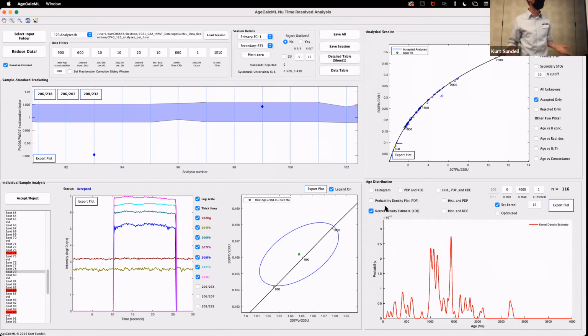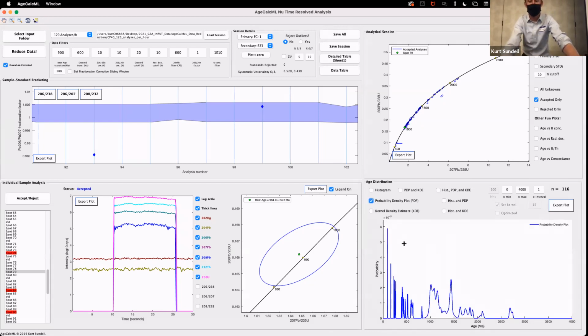But they are a very effective tool to look at your data, in my opinion. I personally use kernel density estimates nowadays for reasons that we'll talk about later, because when you start using quantitative analysis and doing quantitative comparisons, there are some serious issues with PDPs, which you can see very clearly here. And this is a big point that Peter makes in his 2012 papers, says this can lead to misleading results. Look at this highest peak here, it is only high because that Gaussian that it's based on was really, really narrow.